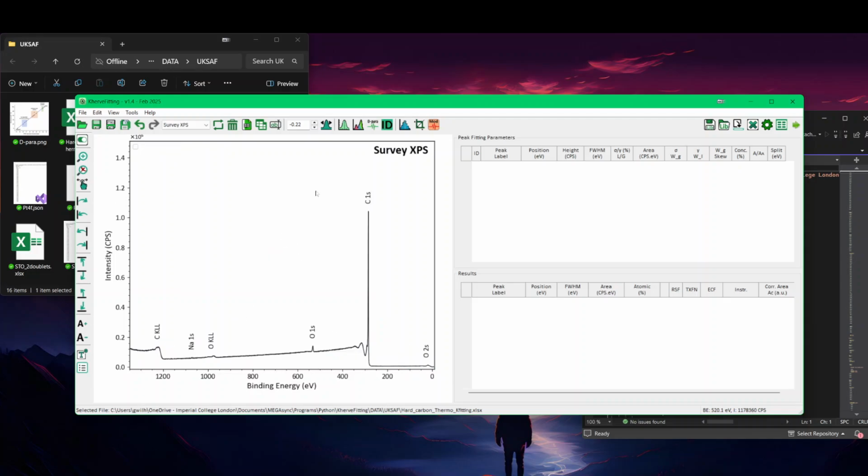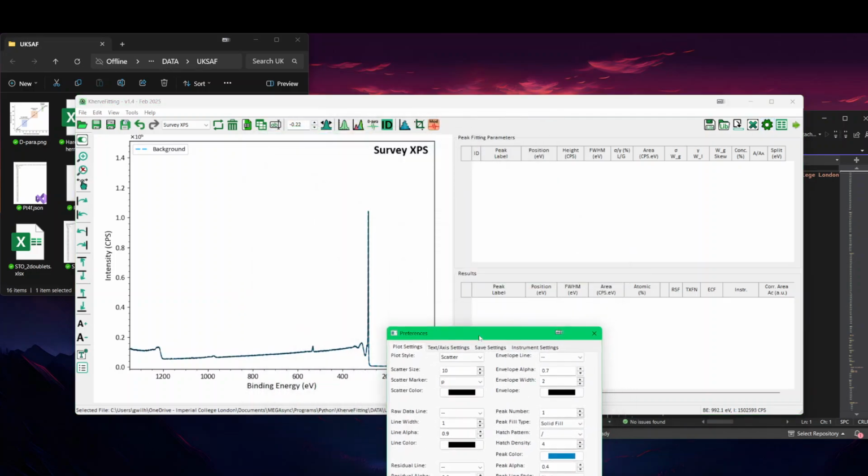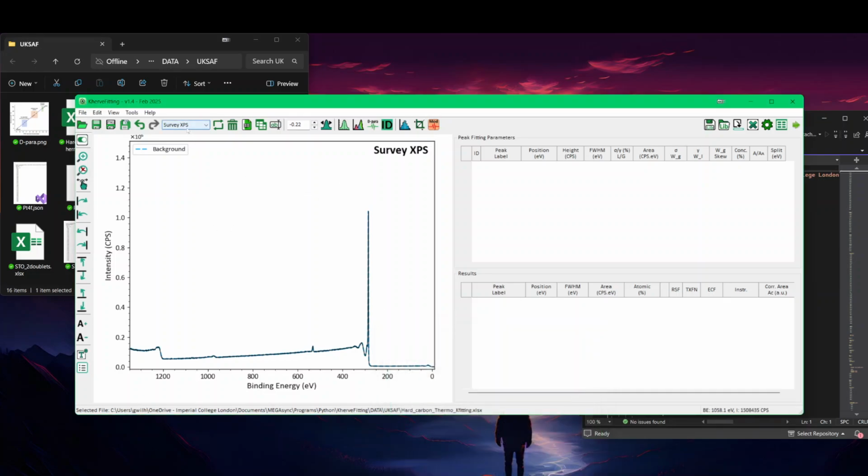And you may find that sometimes, like we just saw right now when I open the preference, the labels are gone. But if you just flip between pages, then it's back.